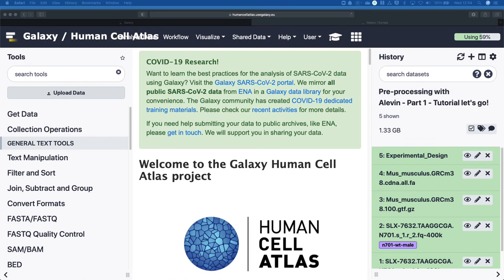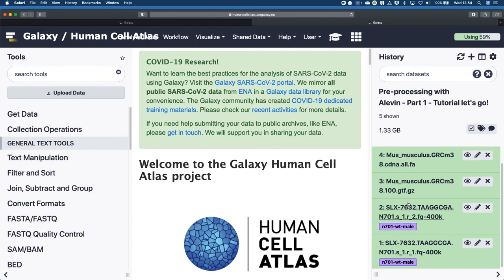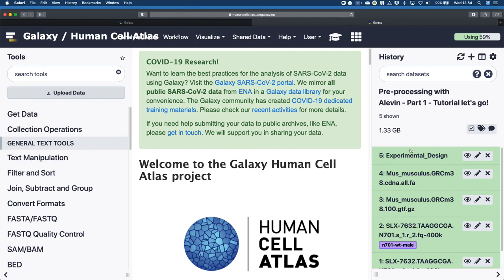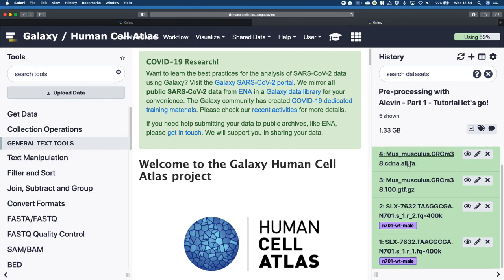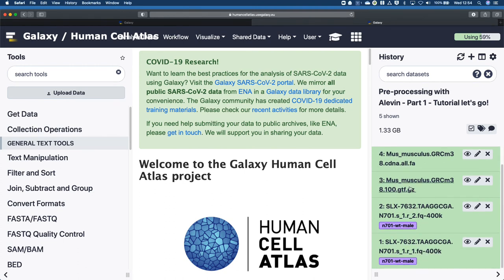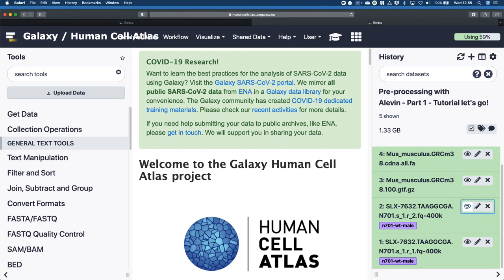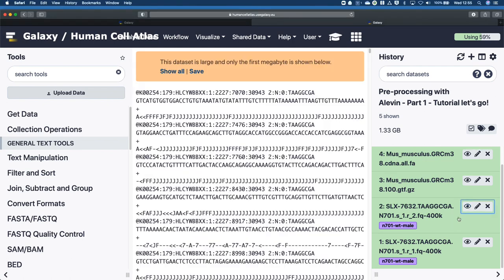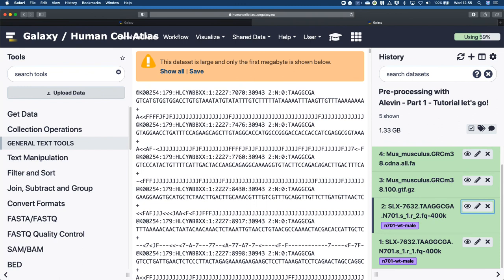All right. And yes, if you do it that way, you don't have to rename the data set. And if I was quite on my game and put any important labels or tags on here that can sometimes help. It's not that big of a help in this tutorial. Right. You're then given some questions to look at different things. We can examine what happens if I do that. And you can look at this here and examine it. That's pretty good.